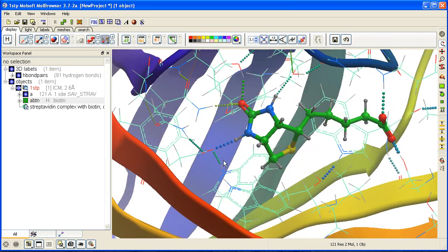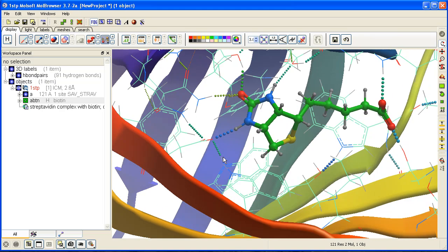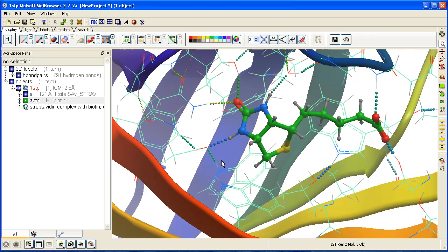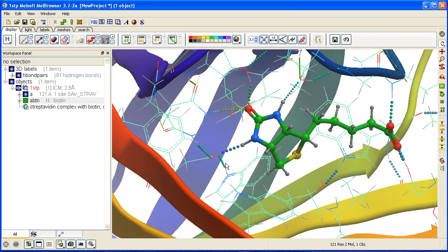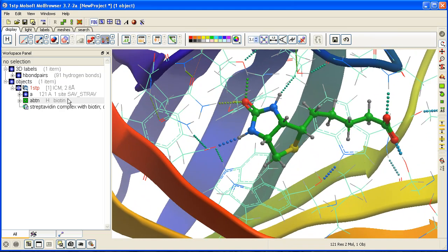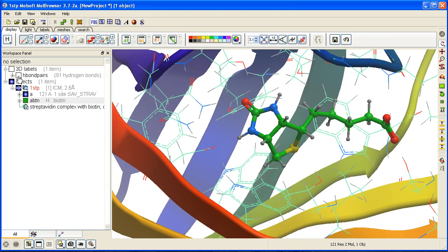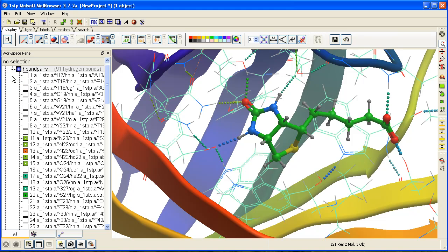You can toggle the hydrogen bonds on and off using the ICM workspace. Here we have hydrogen bond pairs we can display and undisplay. You can expand this and undisplay individual ones or display them.